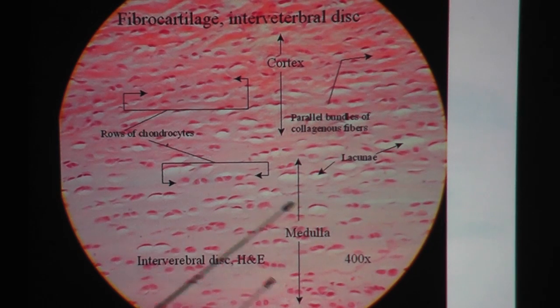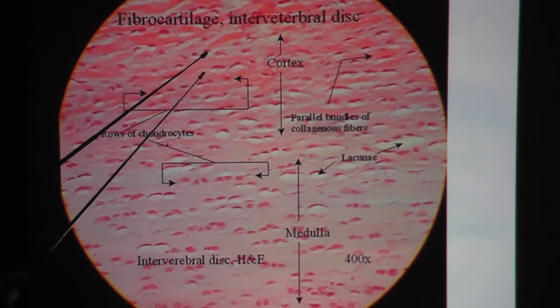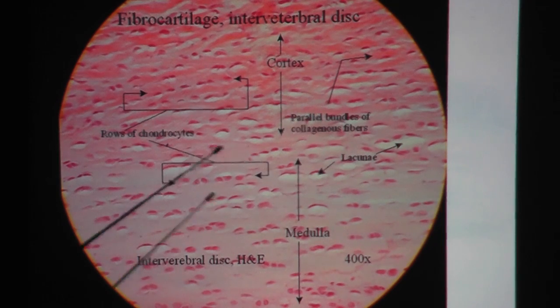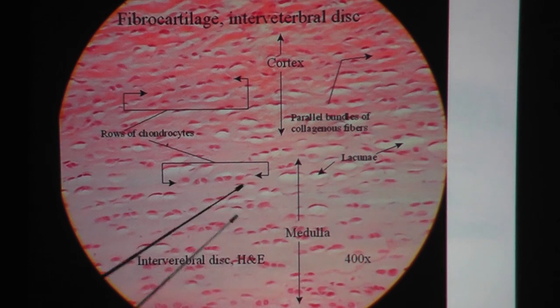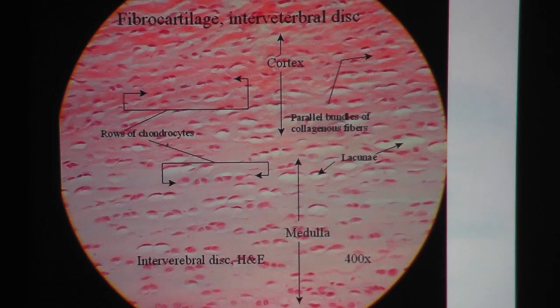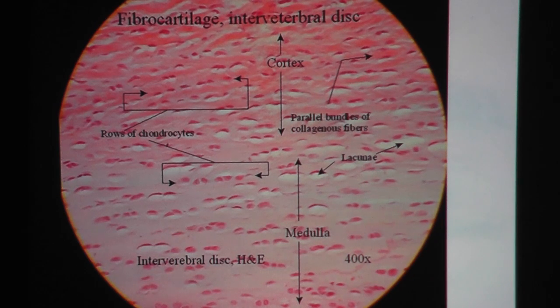This is the low-power view of fibrocartilage in the intervertebral disc. Even on this low view, you can see the chondrocytes. You also see the little white area — the white space around them — and that would be lacuna. In between the chondrocytes, in the matrix, we would have the waves of the collagen fiber, although on the low-power view the waviness of the collagen fiber is not obvious.